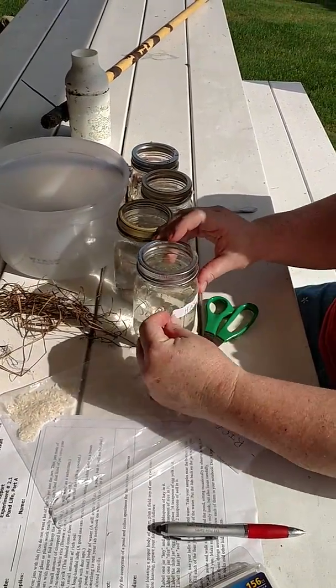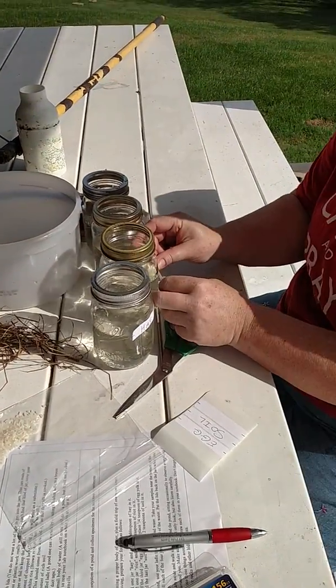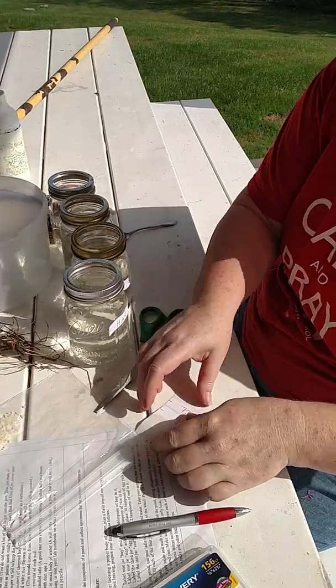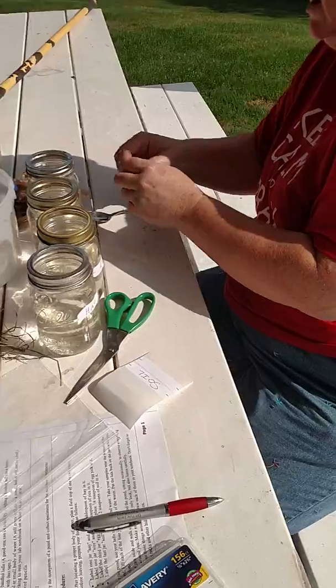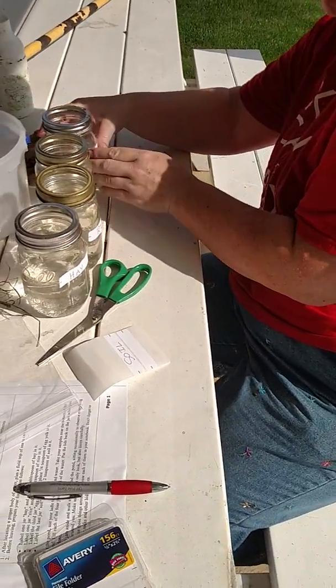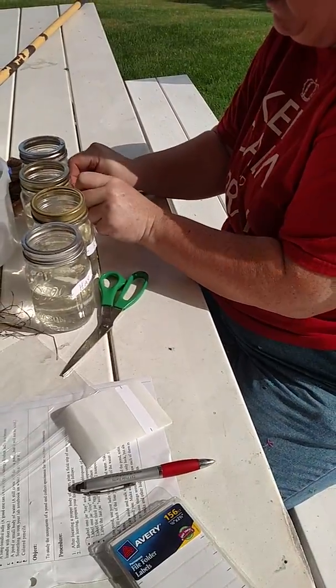So here's the hay. And the rice. And I'll put the egg on this one. Because this has a little dirt in it, so that could be our soil jar. We'll put a little extra dirt in it, but that shouldn't hurt anything.